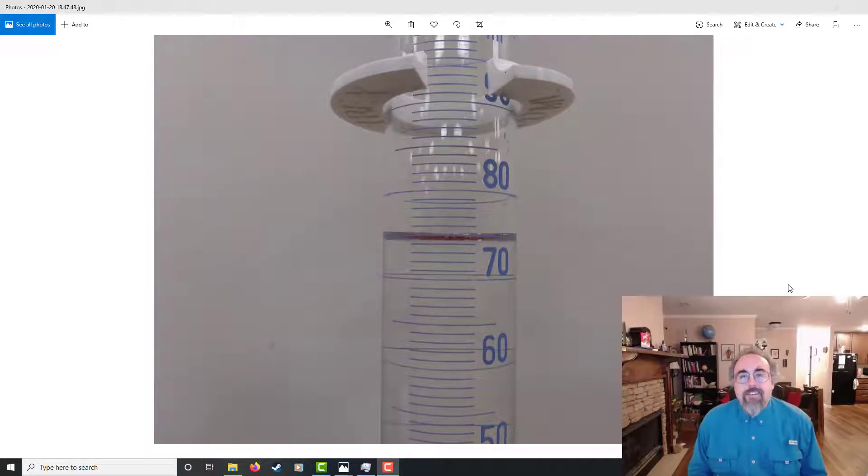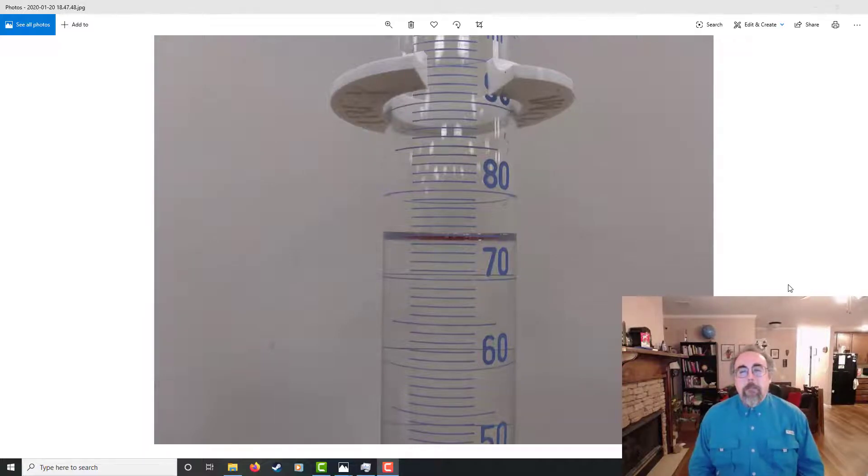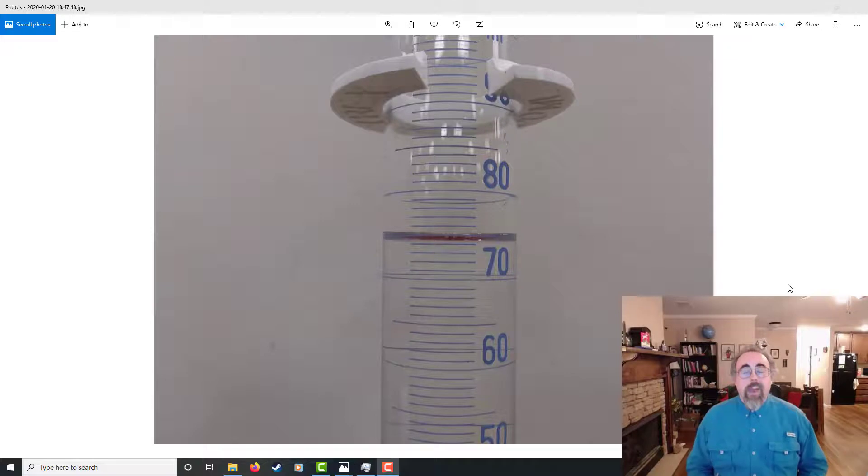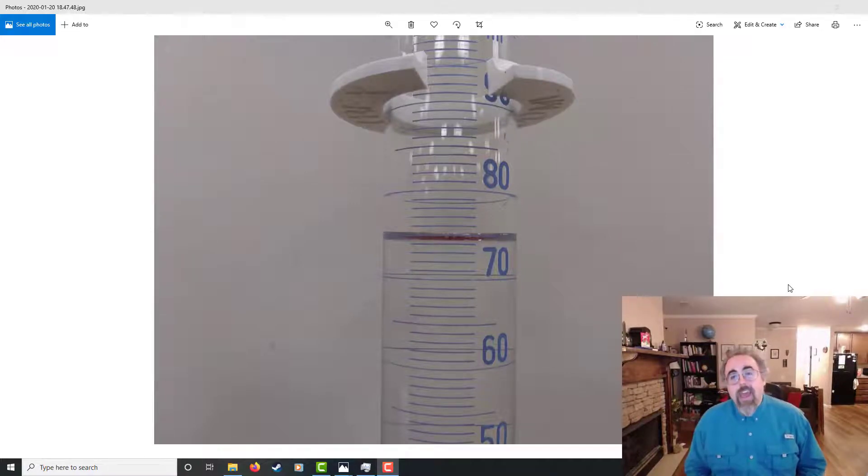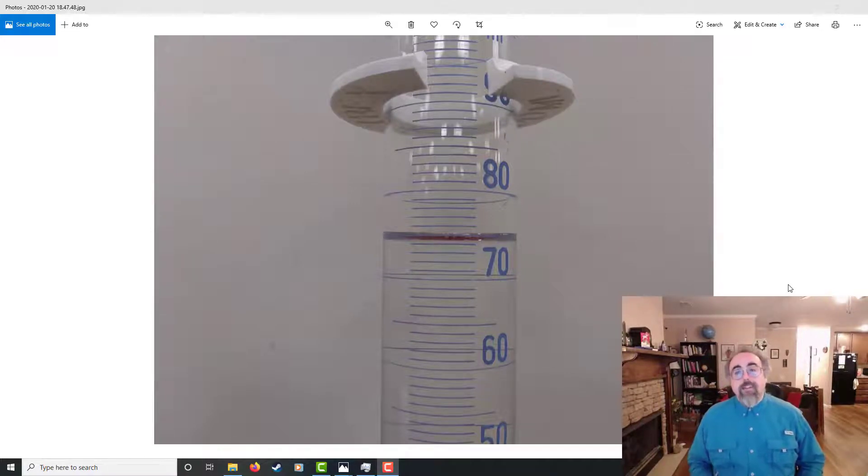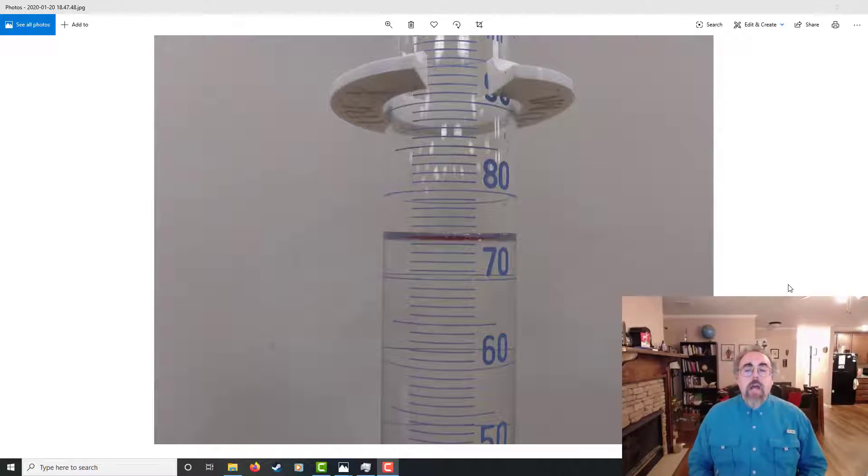Hey, this is Dr. T. Welcome to my computer and my living room. And here I've got some pictures of graduated cylinders. And I want to talk about how you read these, how you get the information out of them.